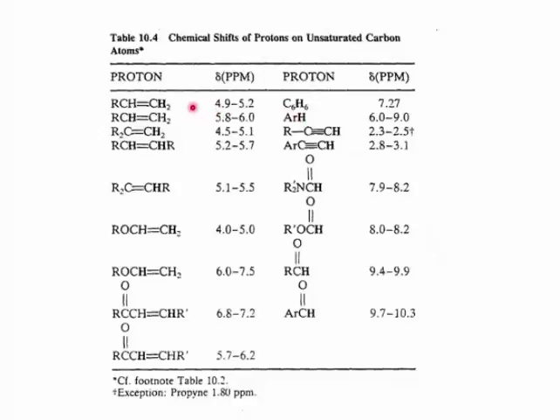All right, let's look at alkene protons. Protons attached to a CC double bond. You can see here that the delta value compared with previously seen values is fairly high, an average of 5 or so. That's a higher delta than we'd seen for the aliphatic protons in the previously listed table.